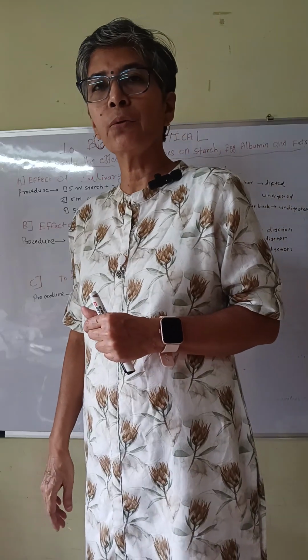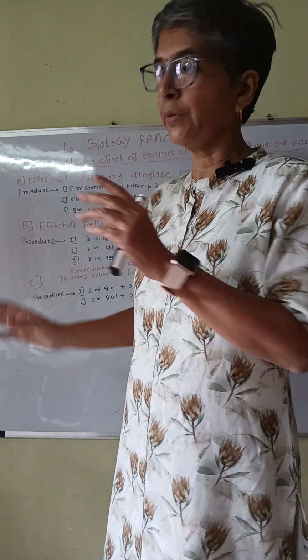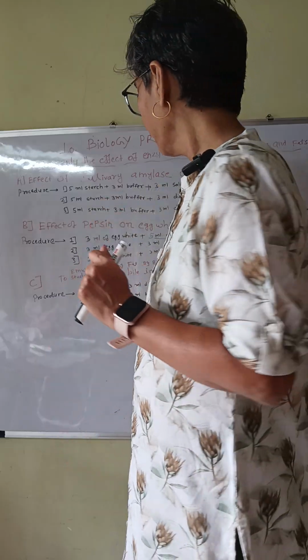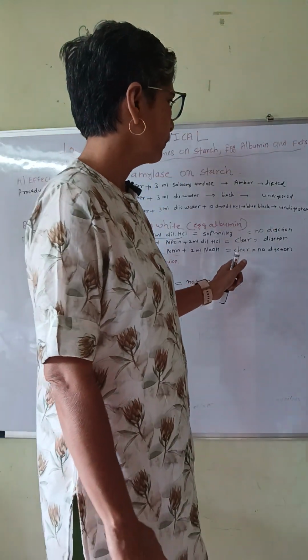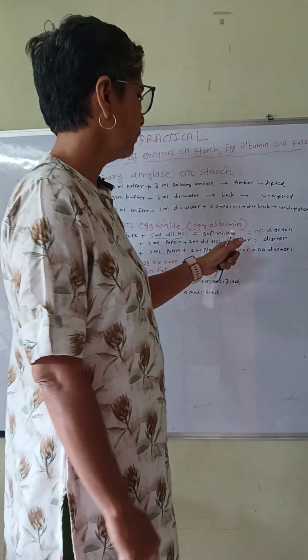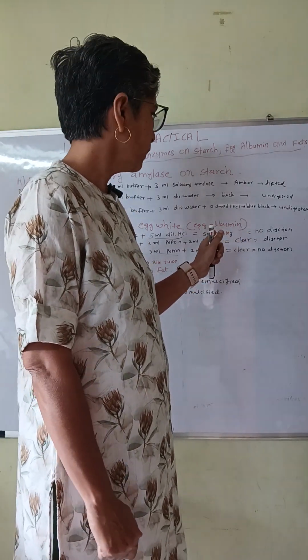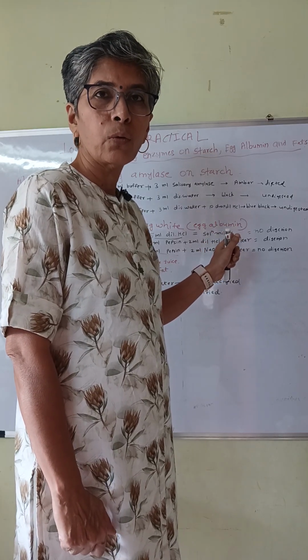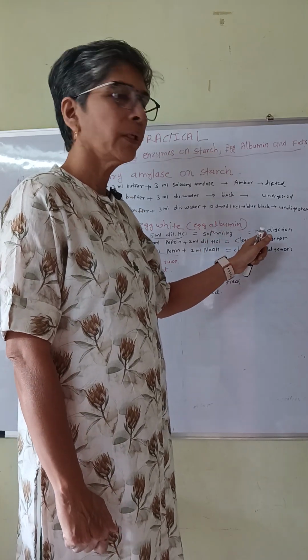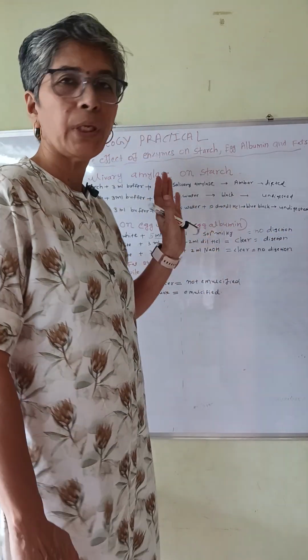So write down your results and observations in the observation table. In the conclusion, you have to write: we see in the first test tube the solution is milky. This indicates no digestion of proteins.